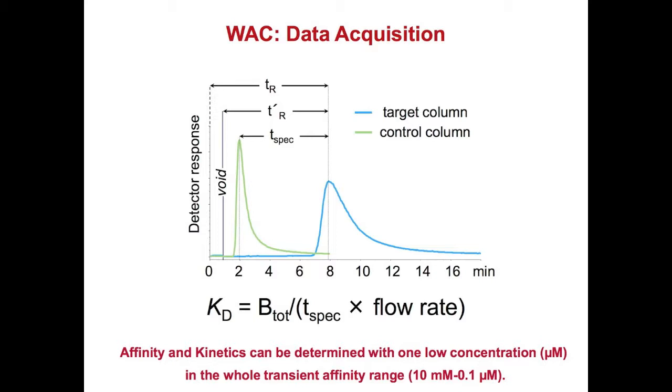But we are well placed for that because we're working with LC-MS. We can work with very small amounts. So that's it. I'm not going to go into the kinetics; that's a separate talk. But I think the message is that we can handle the kinetics too. And if we can handle that well, it's going to be a really big plus.